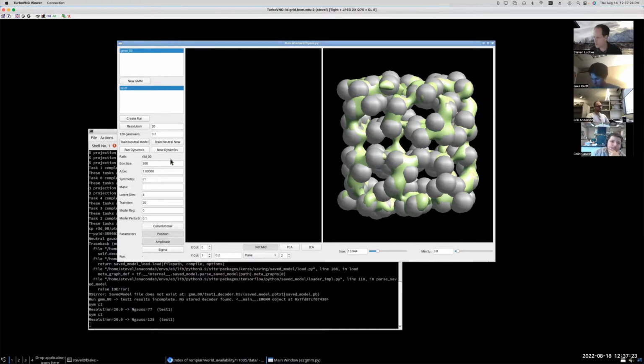If you've ever heard me talk about this before, Muyon's original Gaussian mixture model approach had serious memory problems. You could only look at structures with a fairly small number of Gaussians, so you couldn't tackle a high resolution Gaussian mixture model, because you'd exhaust memory on the machine. By getting rid of sigma, I came up with a new strategy which has no problems with RAM at all. That's why it's now possible to do this with subtomogram averaging, and it wasn't before: we've gotten rid of sigma, basically.